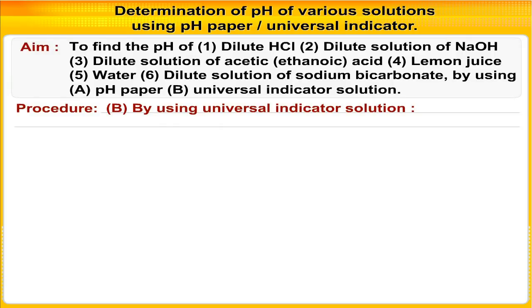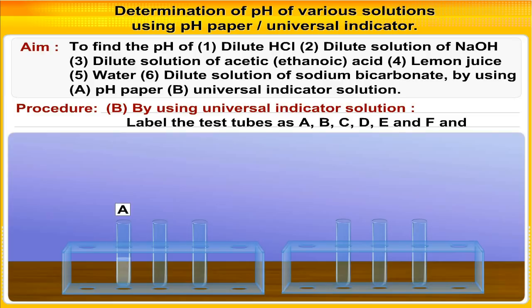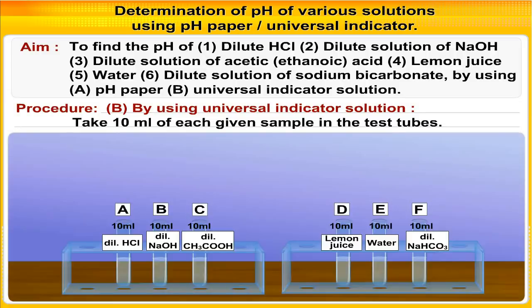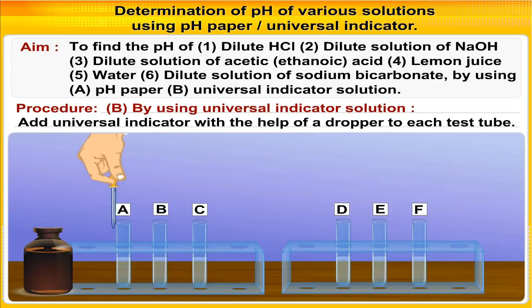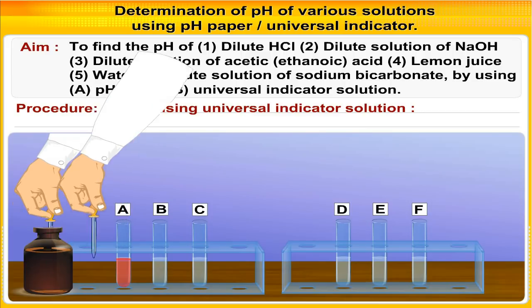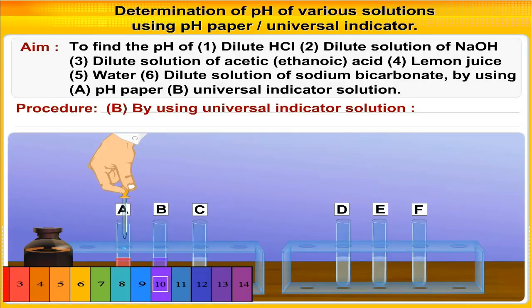Now let us see the values of pH using universal indicator. Take 6 clean and dry test tubes, label them as A, B, C, D, E, and F, and place them in order in a test tube stand. Take 10 ml of each given sample in the test tubes. Add 2 drops of BDH universal indicator — BDH stands for British Drug House — with the help of a dropper to each test tube. Observe carefully the color of the solution in each test tube and match it with the different color shades given on the universal indicator bottle. Note the pH given against the color which tallies with the developed color in the solution of each sample.